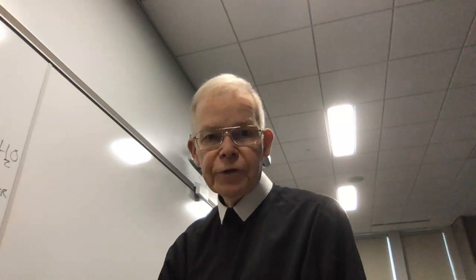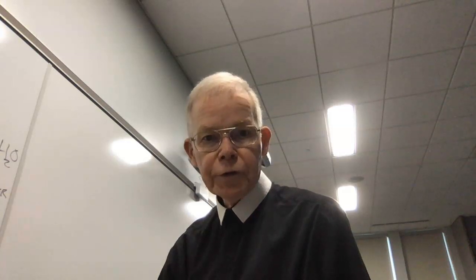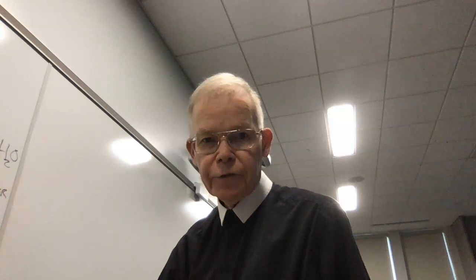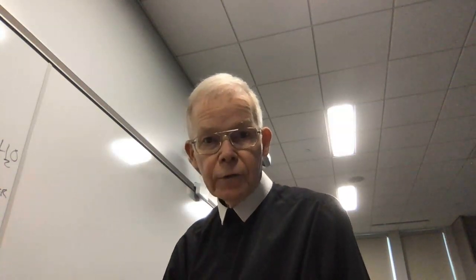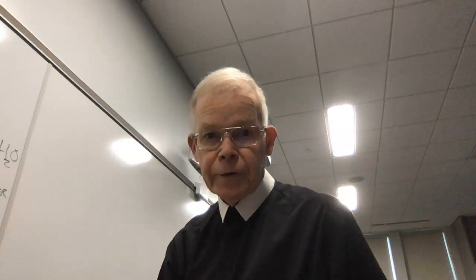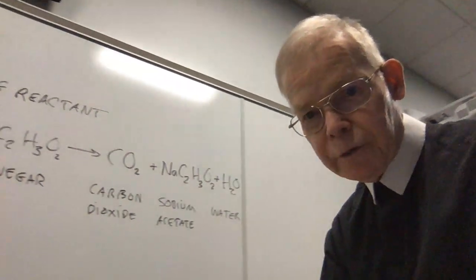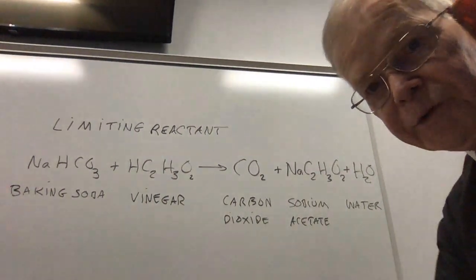Today what I want to show you is another experiment that deals with the topic of stoichiometry, but focuses down a little bit further into the idea of when a reaction occurs, do you ever have anything that's all used up, or do you have things that are in excess? I'm going to turn my computer here a little bit so you can read what I have on the board and copy this. The topic is called limiting reactant.